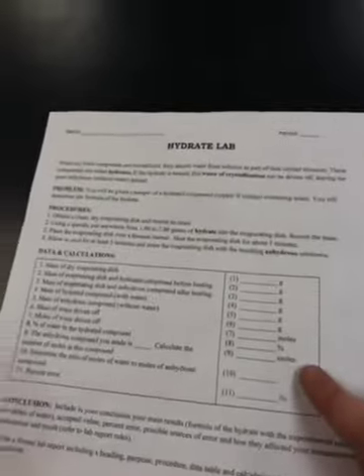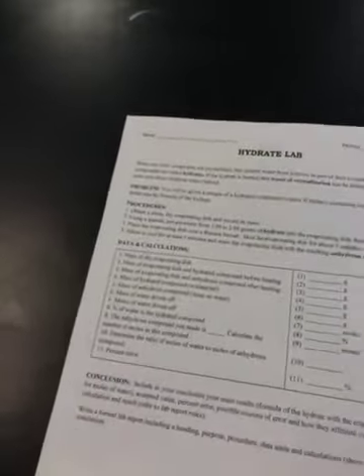All right, so if you do the calculations here, those will lead you to number 10, which is the ratio of the moles of water to moles of anhydrous, which is your X, so that you can get the formula of the hydrate.